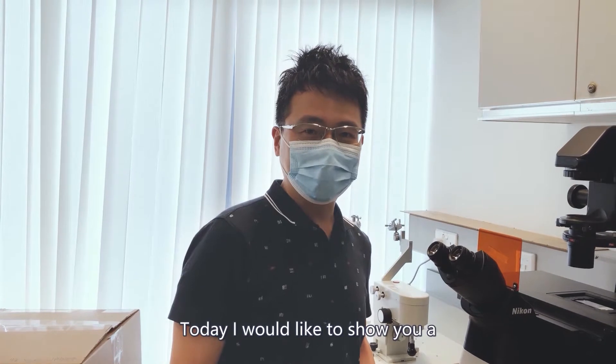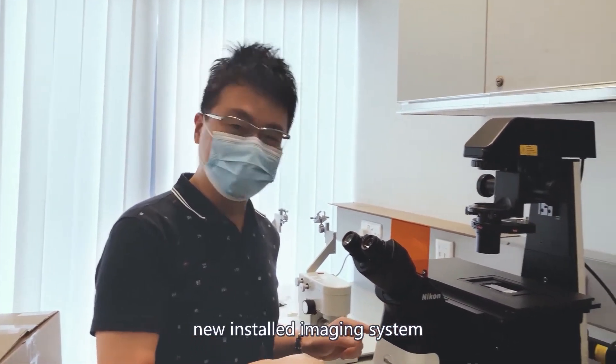Hello, today I would like to show you a new installed imaging system.